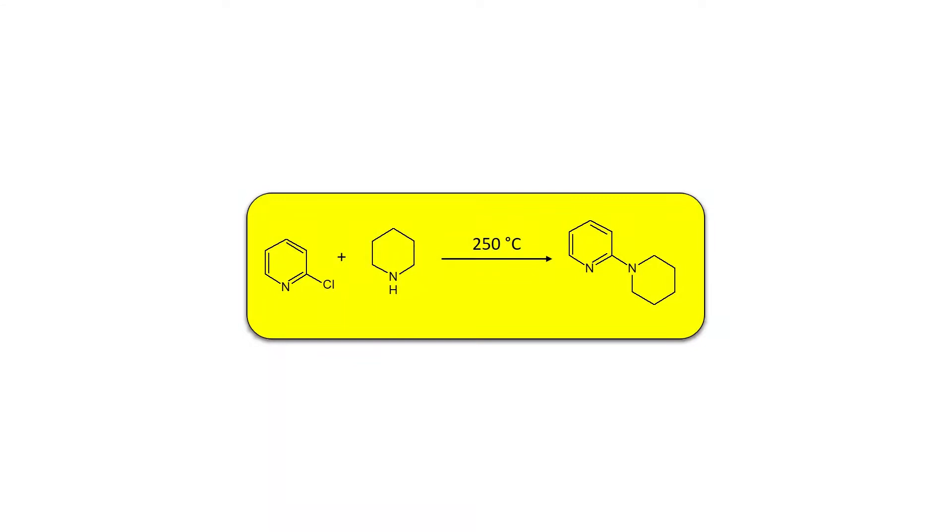Hello and welcome to VaporTech. Today we're doing a high-temperature nucleophilic aromatic substitution using our high-temperature reactor.